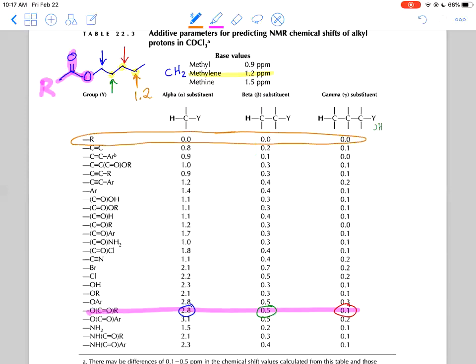Now, when you get to this one, you're going to be starting with 1.2 and all that's nearby is just an alkyl group, just an R group. So you'll find that the base value of this is just going to be straight up 1.2. Whereas, calculating the remaining ones, particularly this one here and that one are going to be just a little bit bigger than this 1.2 value. And that is just kind of helping you guys figure out which two might be overlapping. I'm not saying that some two in particular that I've talked about are going to be overlapping signals and that's actually what you're trying to find. And the best way to do that is by calculating the values.